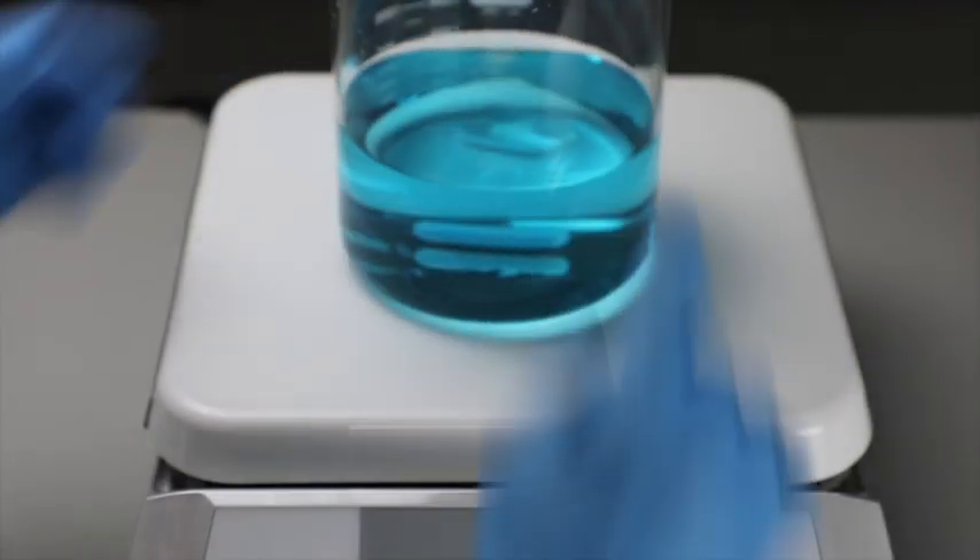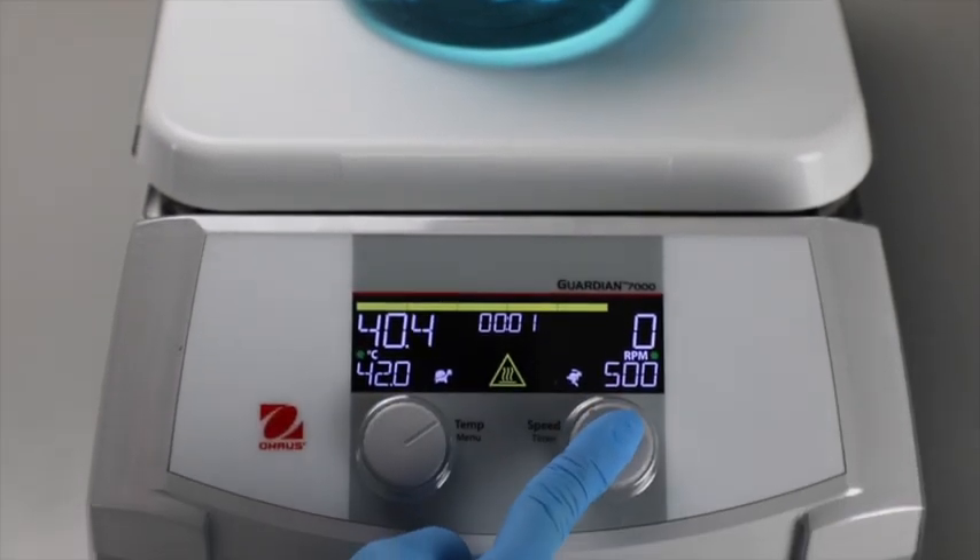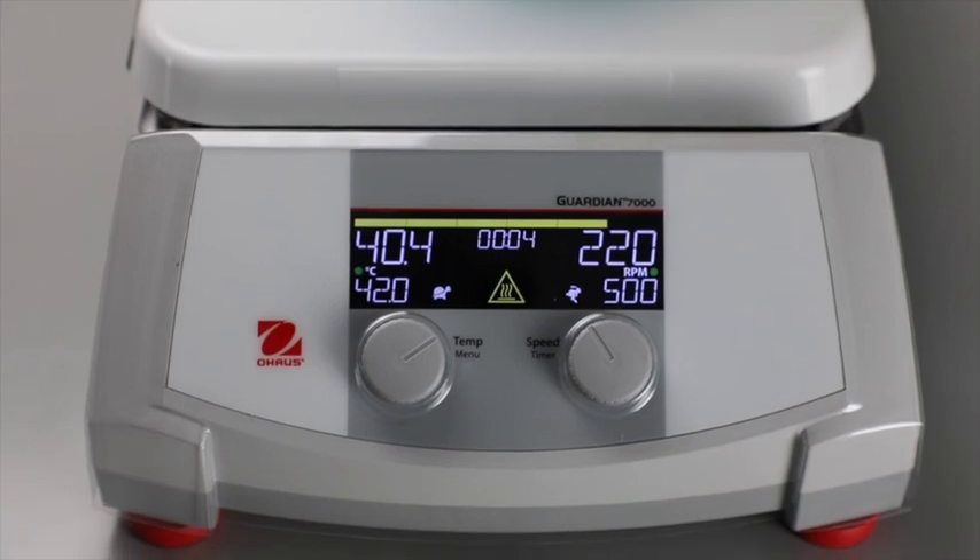Smart Rate enables precise sample control with or without the included temperature probe, allowing the unit to select fast or slow temperature and speed ramp rates.